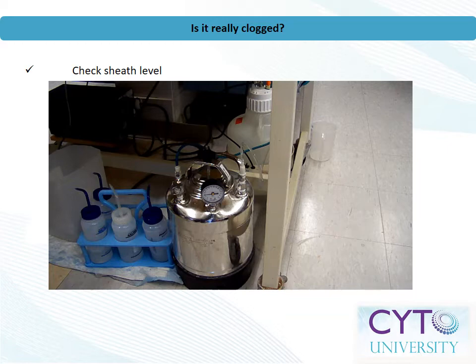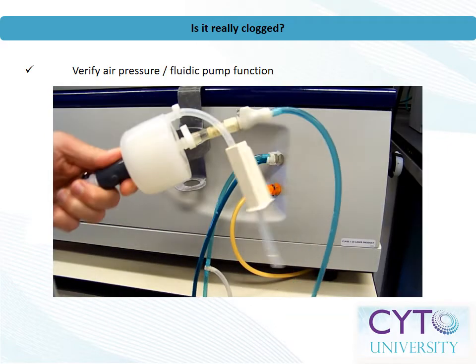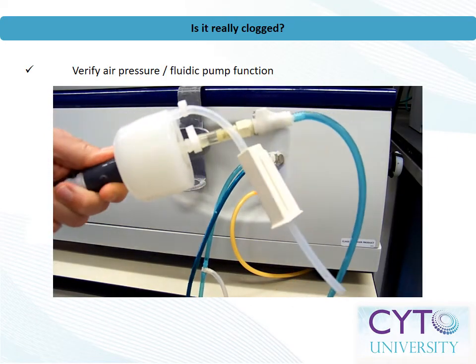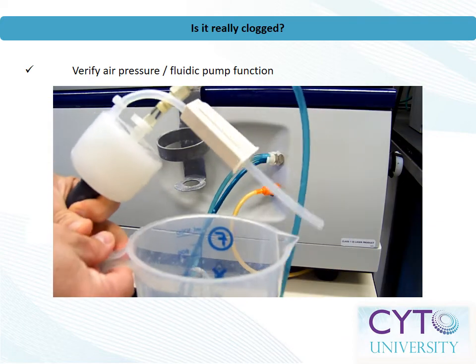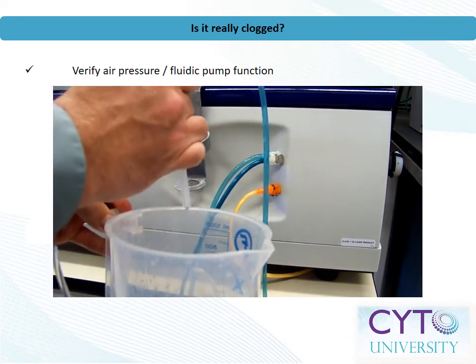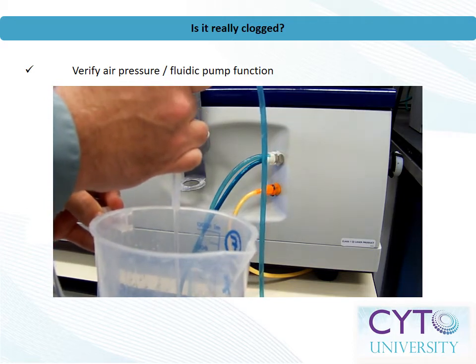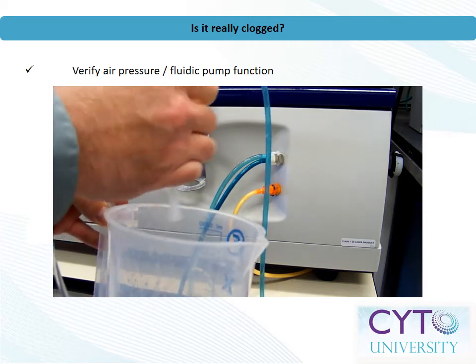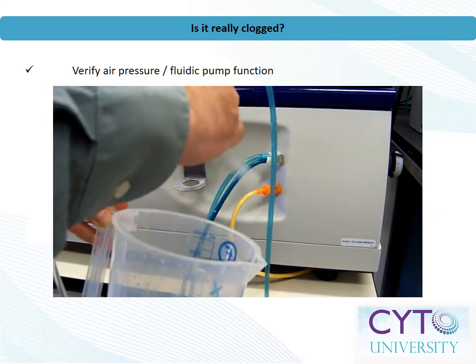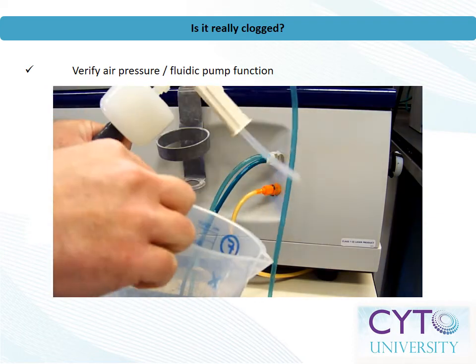First, let's check the sheath fluid level to be sure there is enough. Next, let's be sure no air bubbles have airlocked the sheath filter. Trapped air can typically be vented through a valve on the sheath filter. Carefully unscrew the vent cap or roller valve until only liquid escapes. If your instrument is equipped with a hydrophobic filter on the waste cap, check that as well to be sure it isn't wet.